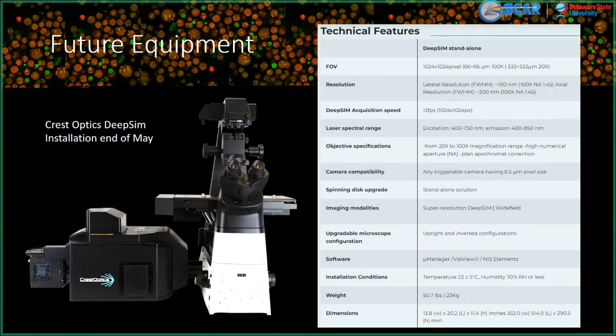It's one of the very first super resolution techniques, but when all these other techniques came out, such as STORM, D-STORM, and PALM, these are stochastic techniques where you're looking at lights blinking on and off, and then an algorithm later reconstructs the image. In many ways these are breaking the resolution limit, but they're still bound by the optical system that is diffraction limited.